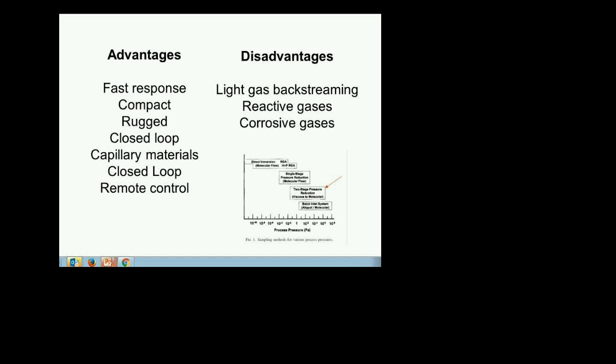And the other one is to make sure the electronics do not get hot. So, two rules of thumb: if you use an electron multiplier, you cannot operate above 100 C. So if your probe is higher than 100 C, you cannot operate the electron multiplier. No, I'm not going to use a multiplier. Okay, so then the next.